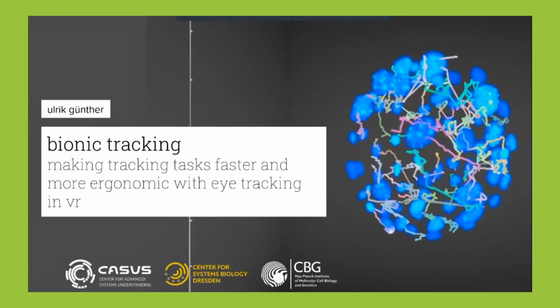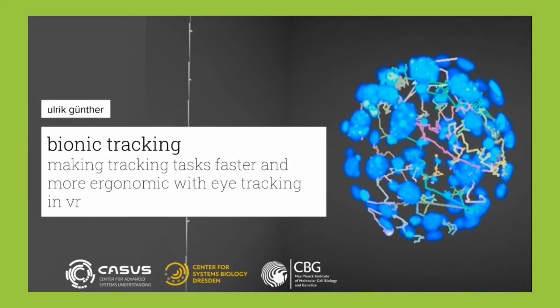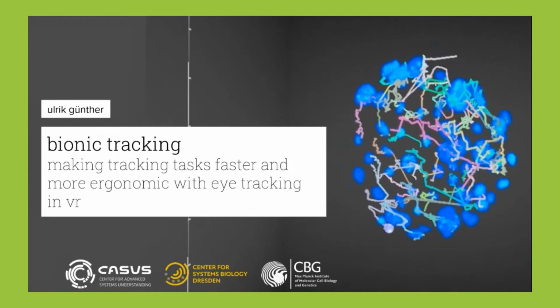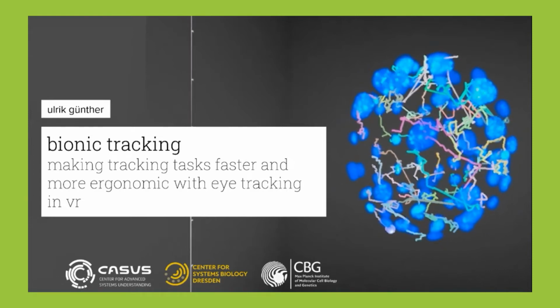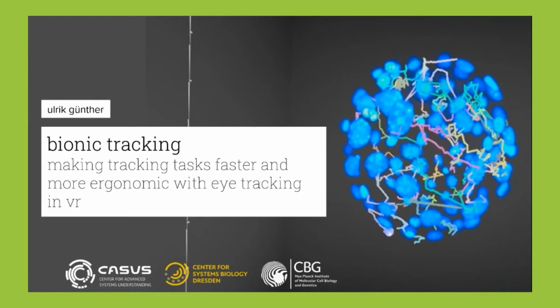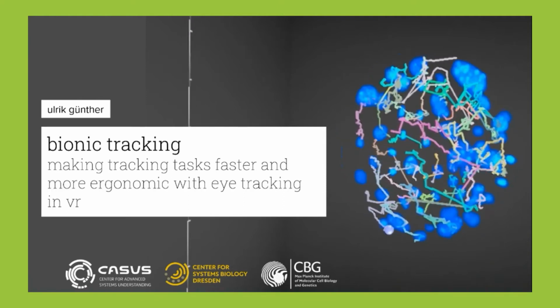Thank you very much for the kind introduction and for having me. Welcome to my talk about mainly a recent publication we had at the ECCV conference in bioimage computing last year. It's called Bionic Tracking, and the entire project is about making cell tracking tasks faster and more ergonomic with eye tracking in virtual reality. My name is Ulrik Günther, as Johanna has already told you. I'm with the Center for Advanced Systems Understanding in Görlitz, Germany, and also associated with the Center for Systems Biology in Dresden and the Max Planck Institute for Molecular Cell Biology and Genetics.